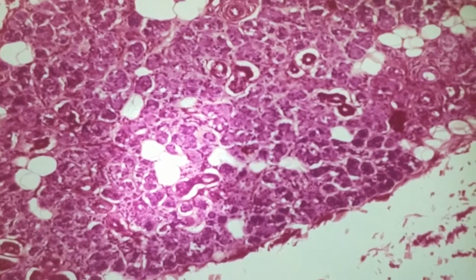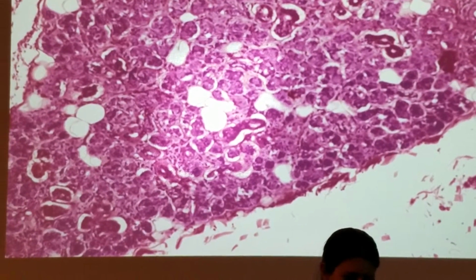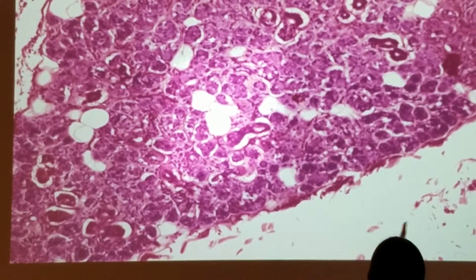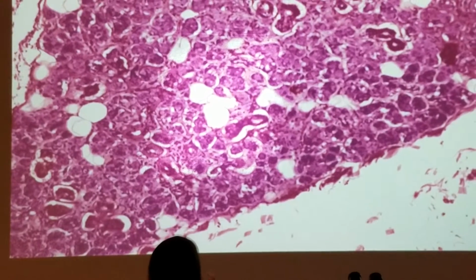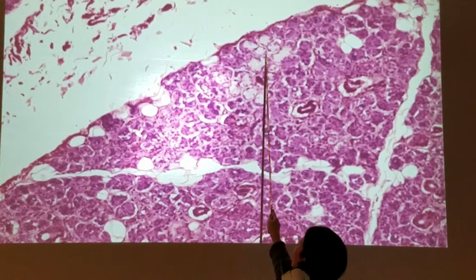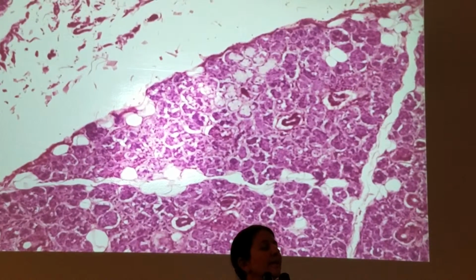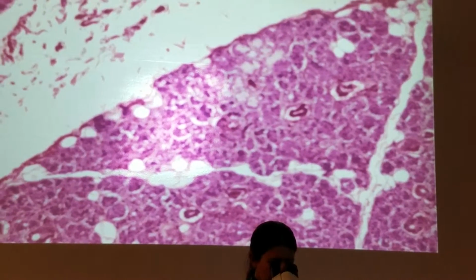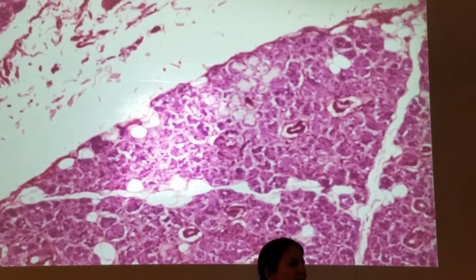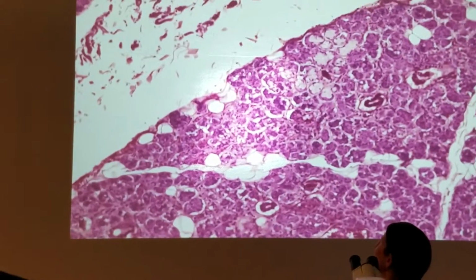Back to this one. Is that one at the bottom? Bottom. Which way? You're right. Here. No, bottom left, looks like right in the middle. You can see. So that big white area, is that more adipose or is that an actual? No, I think that's just connective tissue that's in there, because the gland is going to have some of that structure right there. Sorry, when I focus it on here, it's not focused up here.